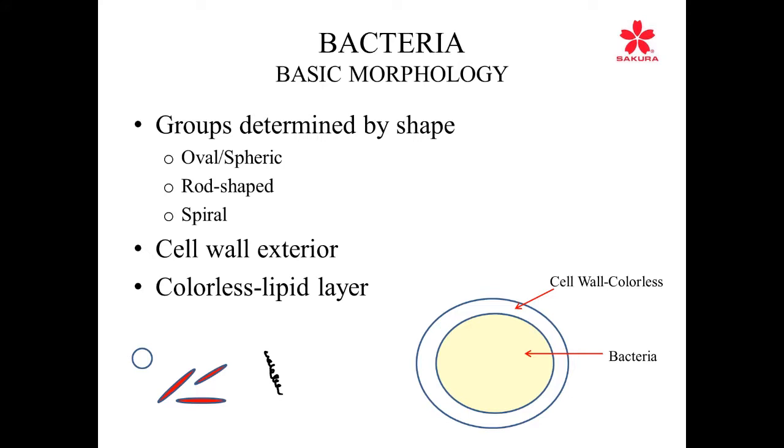Let's go back to bacteria with the basic morphology. This is the key thing so far as classification and the specific staining procedure that you would select.